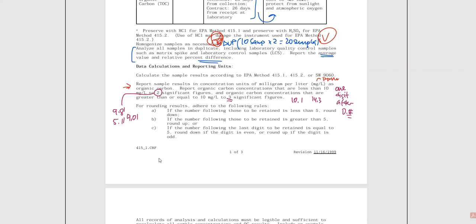By no means do I want to go in and say, oh yeah, we read your TOC and it read 22.431163100000. No, that is stupid. Somebody's going to look at this and say, you're fired. You're fired. You didn't learn anything while you were in school. Absolutely not. This is not appropriate, especially if your machine and our machine does not go that far in the first place. So no, that is not the way that this is going to work.